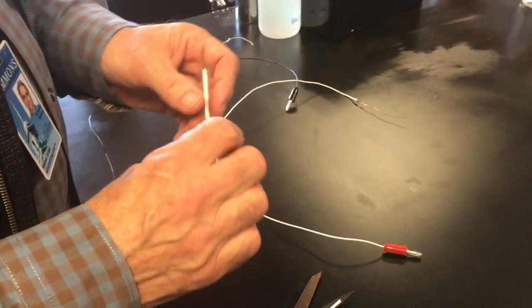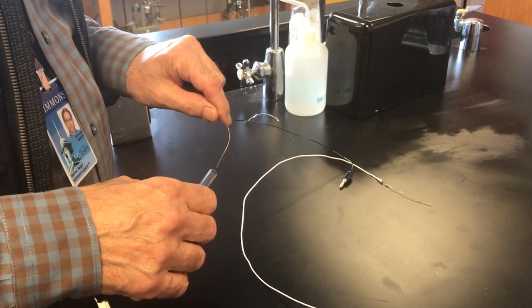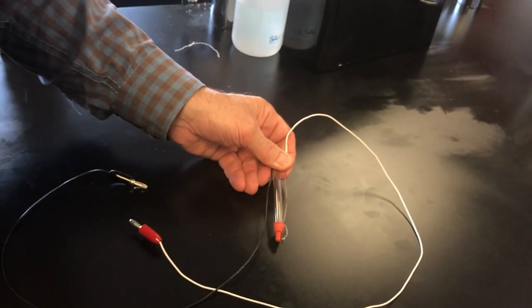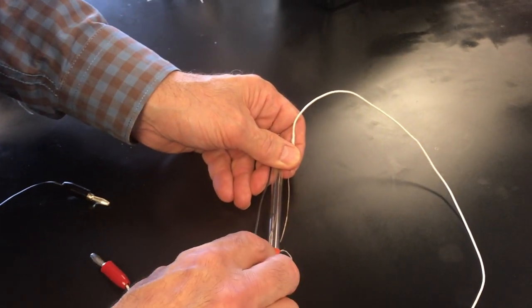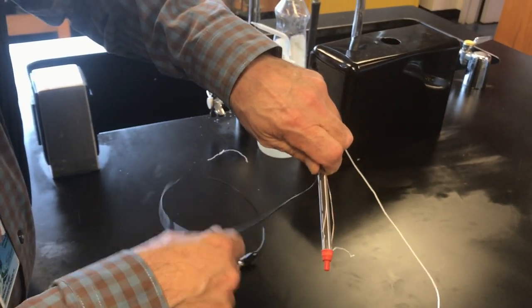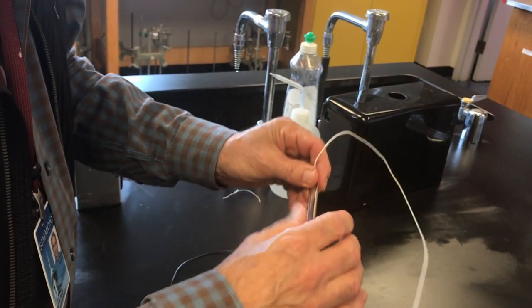Now we have to do the electrolyte. Inside is going to be the copper sulfate solution — that's our copper wire here. This is going to go on the outside like this and stick into the solution. So here we have our septa cap, the salt bridge, the copper wire inside, and the silver on the outside. Now we've just got to make that into one item, either with tape or with a heat gun, using some shrinkable material.